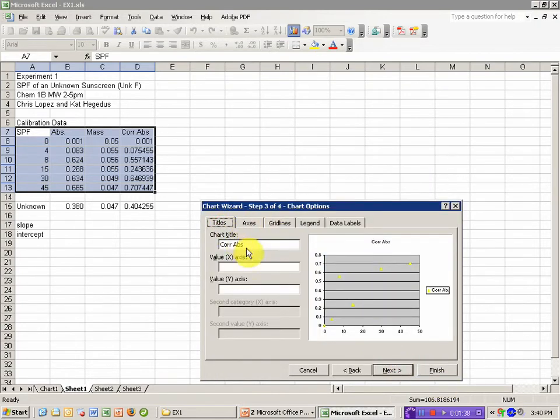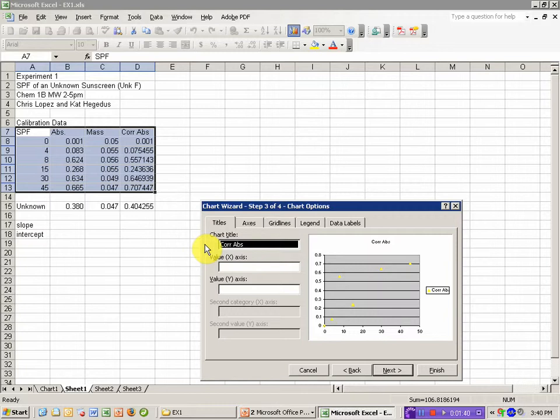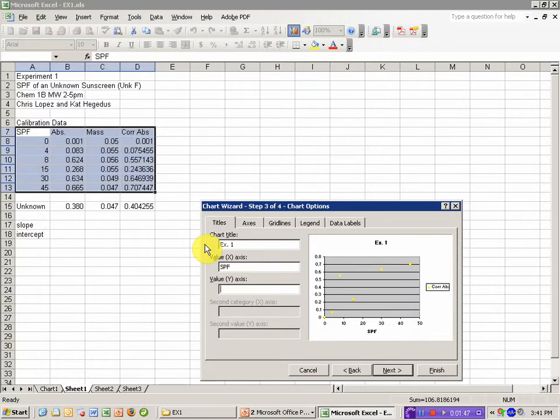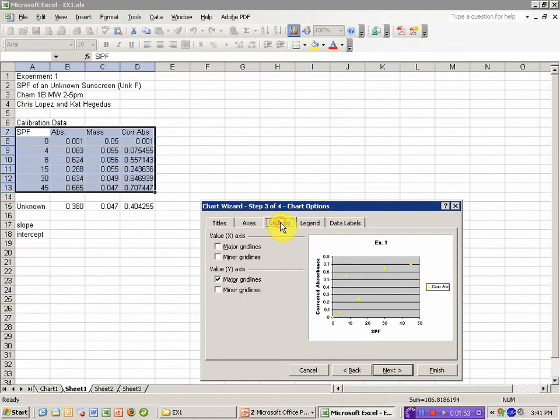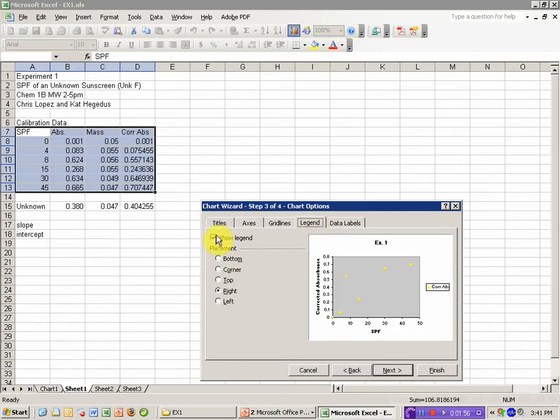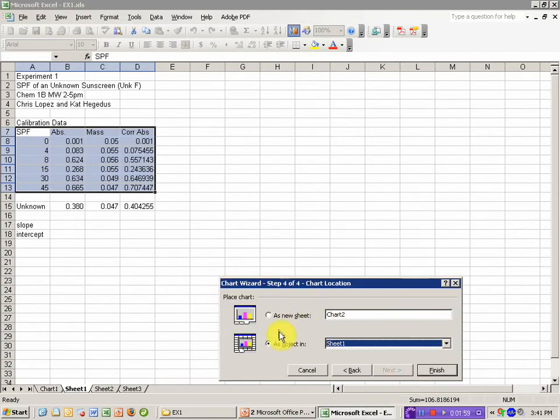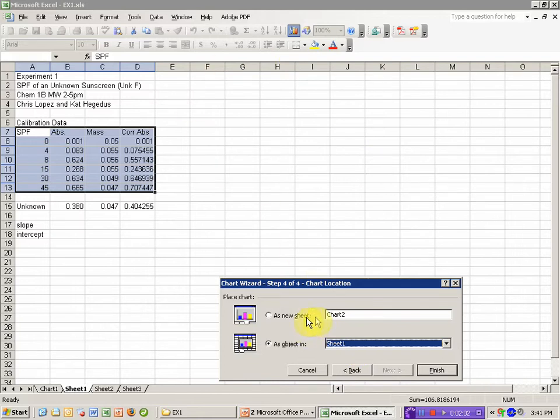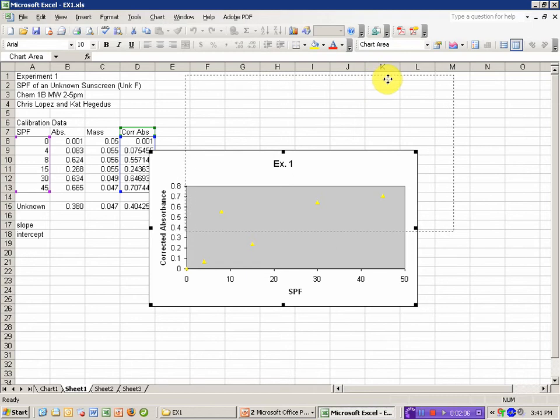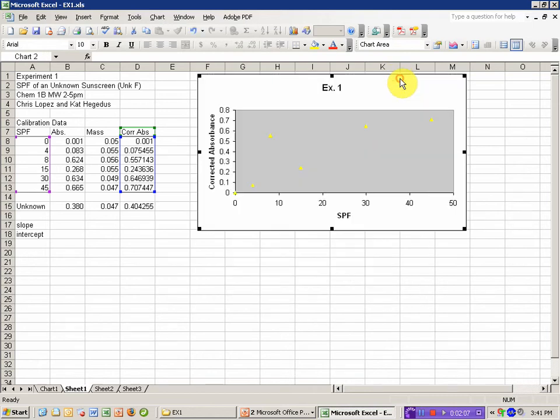I'm going to put in axis headings and a chart title. I'm going to call this Experiment 1, my x-axis is the SPF factor, my y-axis is corrected absorbance. I'm going to drop the grid lines and the legend. I don't need those on this plot. And I'm going to include it as an object in this worksheet rather than its own sheet. And it drops straight in here.